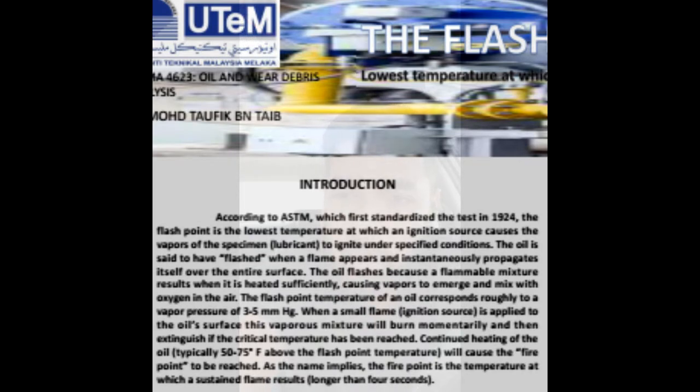the flashpoint is the lowest temperature at which an ignition source causes the vapor of the specimen, for example lubricant, to ignite under specified conditions. The oil is said to have flashed when a flame appears and instantaneously propagates itself over the entire surface. The oil flashes because a flammable mixture results when it is heated sufficiently.